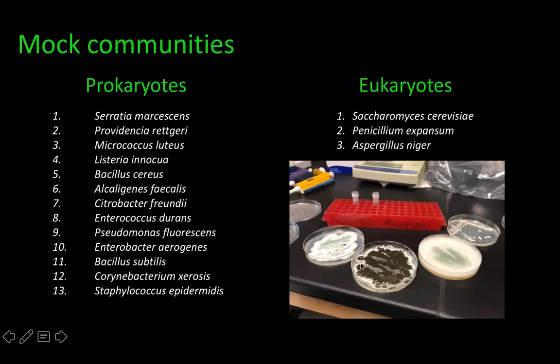These are just some petri dishes of me growing up the eukaryotes in the lab. And I want to give Dr. Patty Erickson the credit for the prokaryotic end of this, because she did the grunt work and she made this mock and she just gave me the mixture of DNA. So thank you for that.